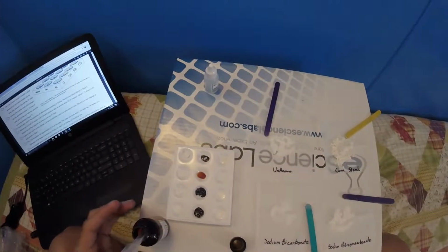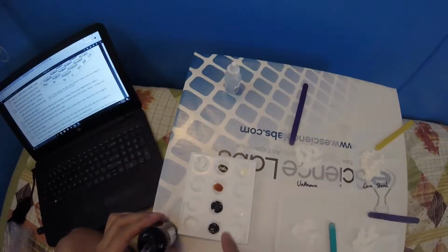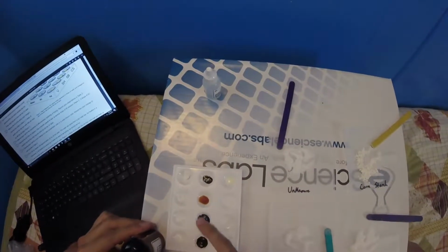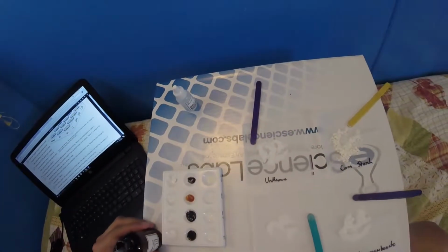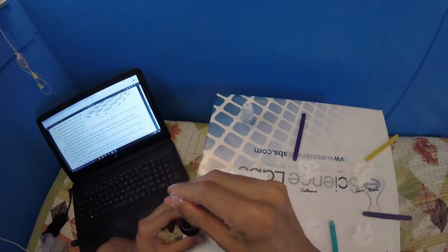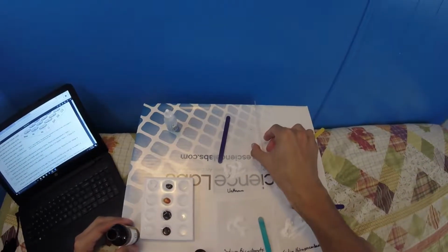Okay, so there's definitely, with the sodium hydrocarbonate, it's definitely fizzing. Also with the unknown a little bit. The sodium bicarbonate just completely went a different color. It's more of an orangey-ish color. And with the cornstarch, it's not really doing much, but it is looking different. But I can definitely tell with these two, with the sodium hydrocarbonate and with the unknown, they're having very similar reactions.